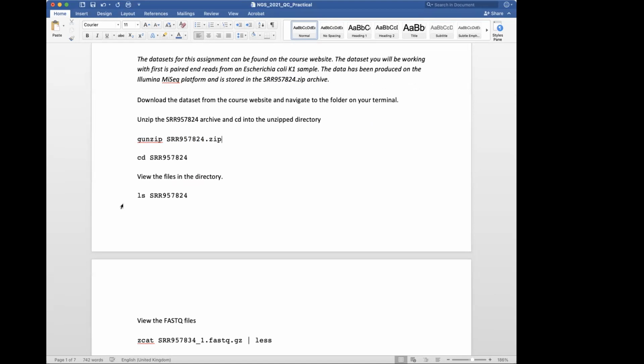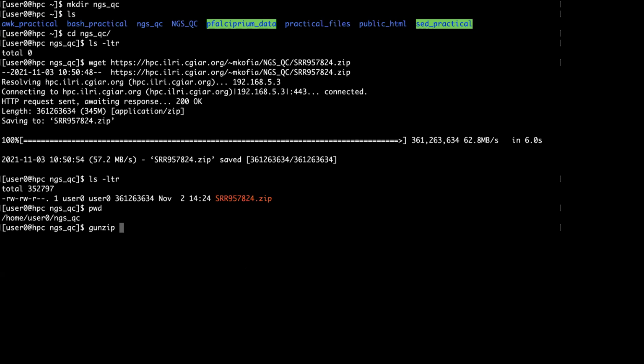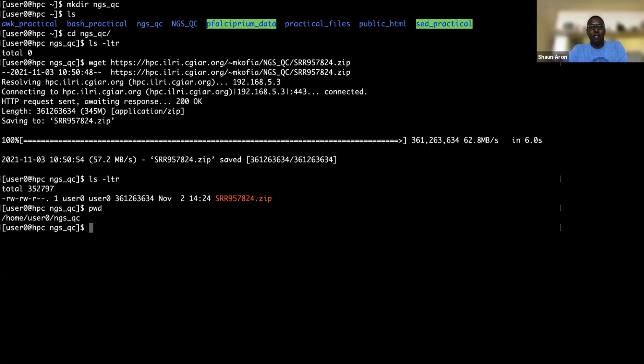Let me see. Alon, please, yes? Sorry, can you please share again your terminal, please, so that again we have a sorry, snap. So because it's, I'm sorry. That's fine. Yeah. Okay, so we're here now, right? You can see my terminal.